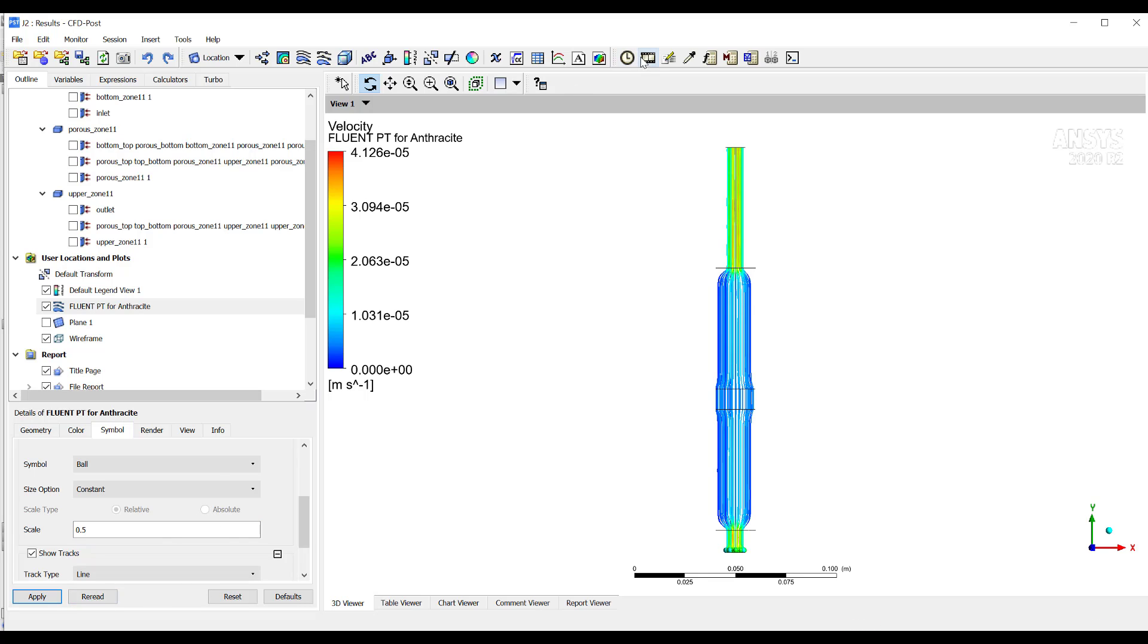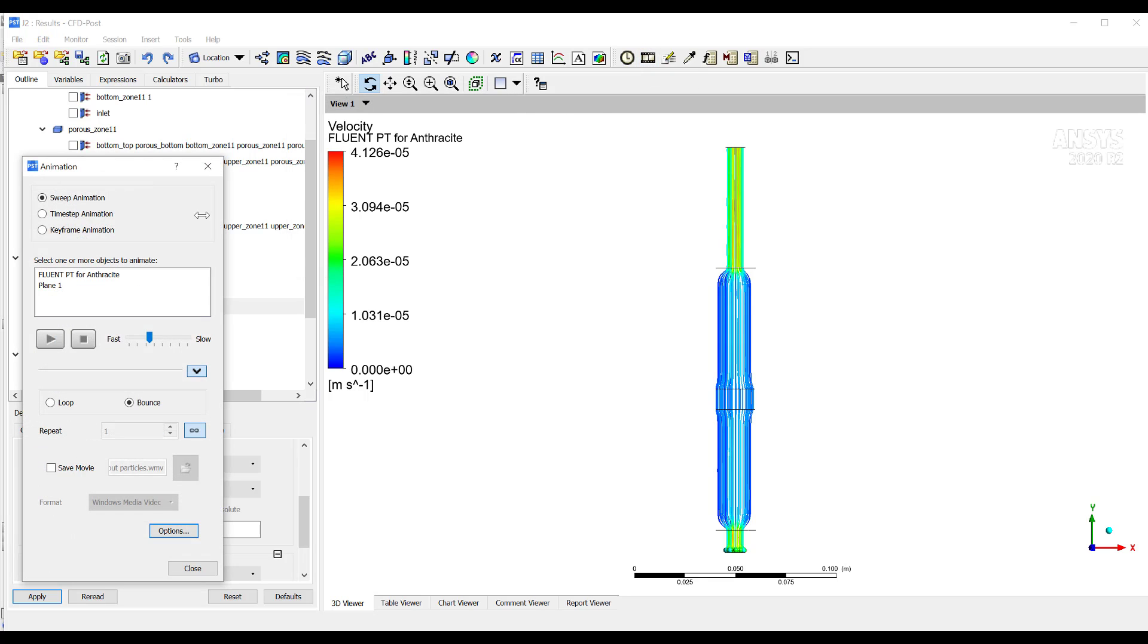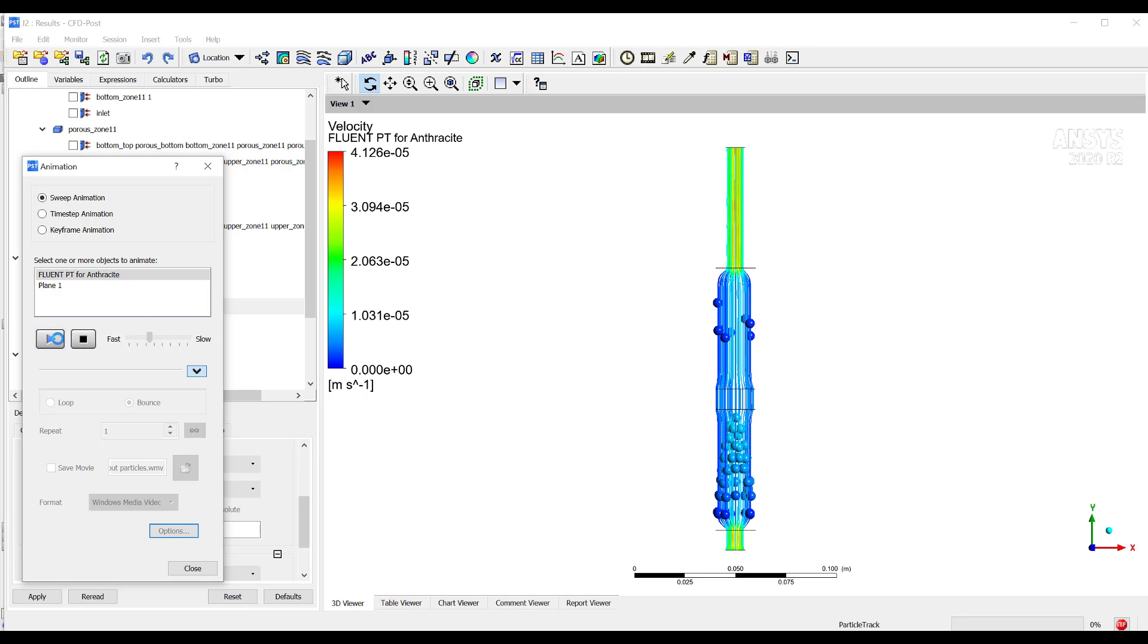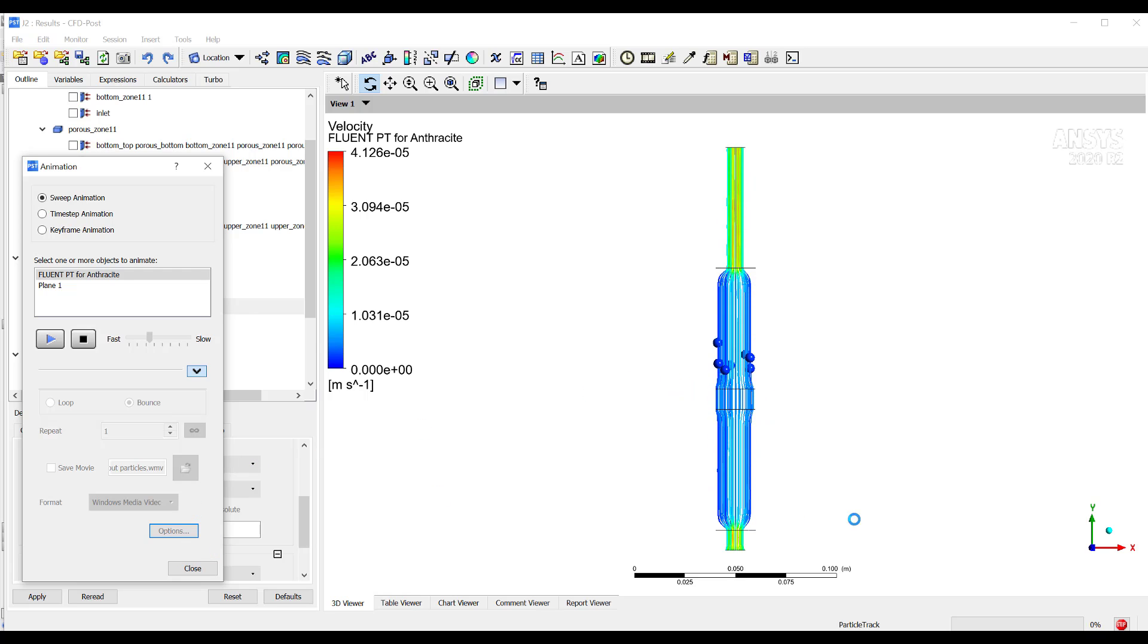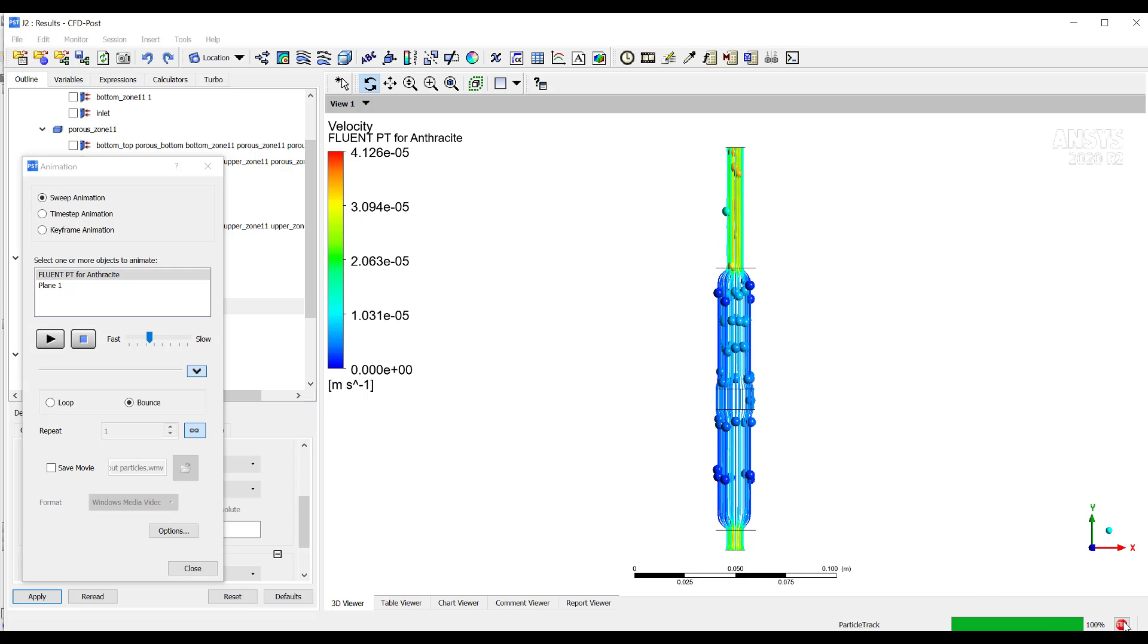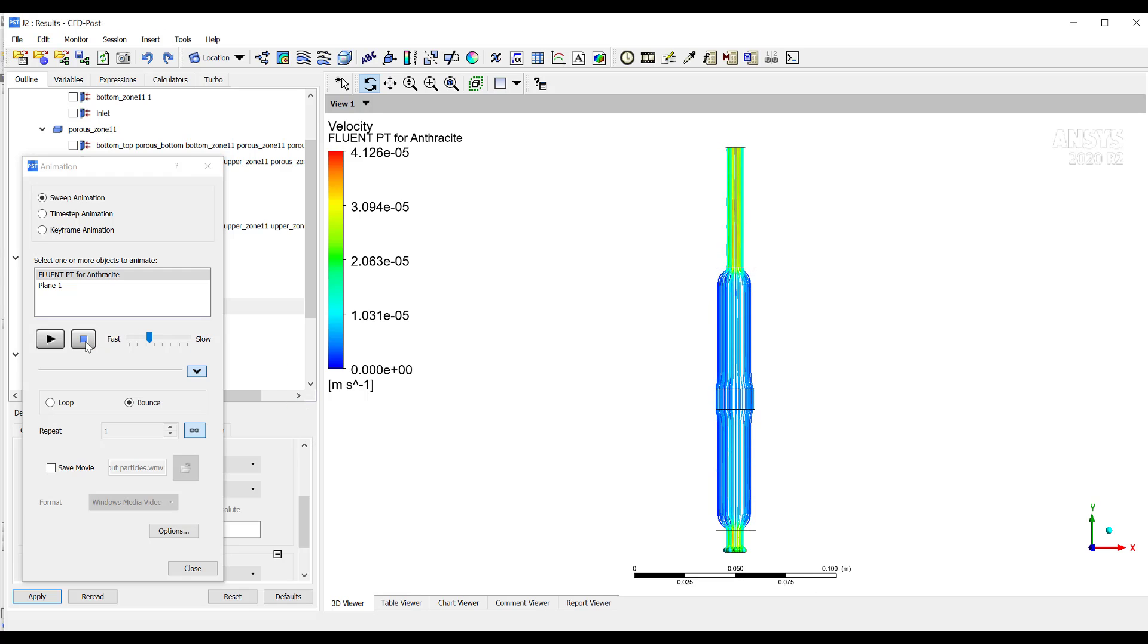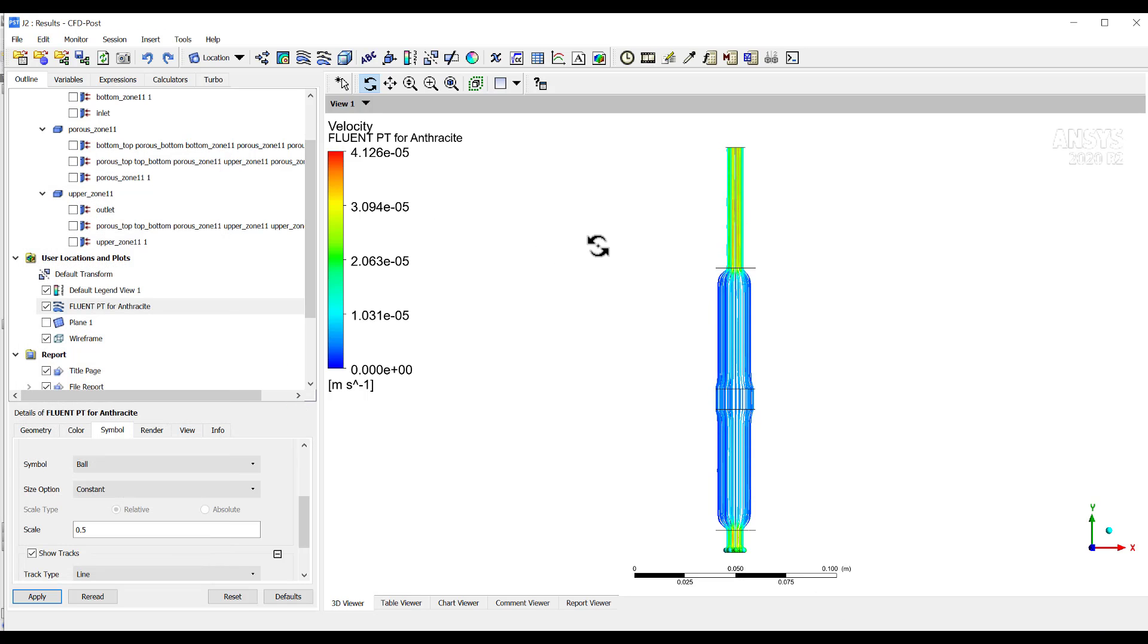Here, then you will see this animation of the particles. Then you can do a lot of things here on CFD Post and many other things processing the results. Then it's very interesting to use. Then you can play with this tool in order to have the data you want to use for your report or for your purposes.